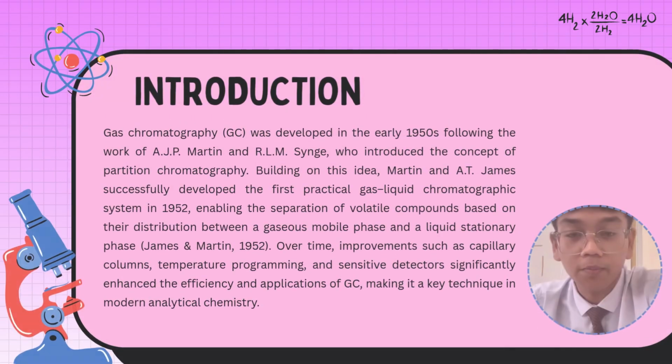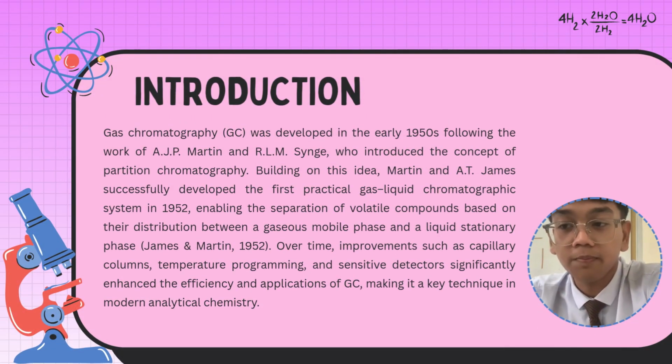Hi, Assalamualaikum. Today, our group will be presenting on gas chromatography, also known as GC, which is an important analytical technique used in chemistry. I will begin with the introduction, focusing on the background and the development of gas chromatography.